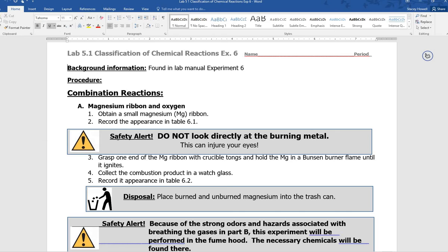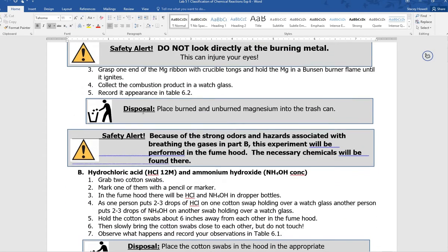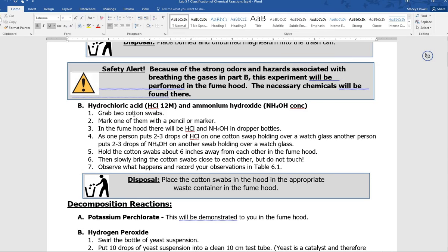Okay. Yes? So for part A and B of single replacement reactions, are we going to do those as soon as we get done? Yes. We're going to talk about that. Okay, so I am going to do this magnesium ribbon with you. You're going to do the hydrochloric acid and ammonium hydroxide. This part right here, please listen. This part B is in the hood in the back. So it's in the back hood.